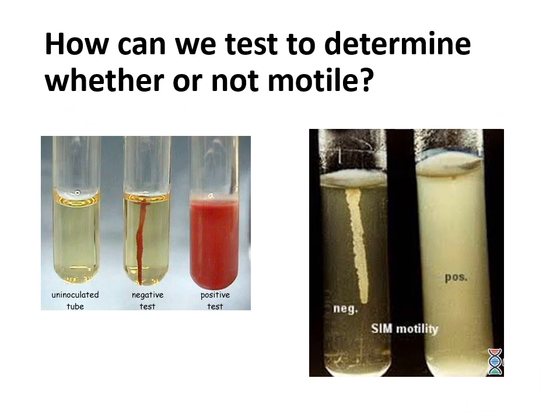So here's a visual so that you can see what I was talking about. Like I said, sometimes they'll put TTC in the agar so that any bacterial growth will come out red. Sometimes instead there will not be anything, no TTC, and so the bacteria will look beige. But either way, the premise is the same.